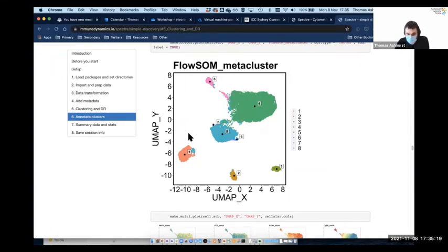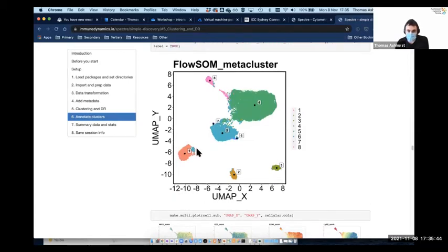Now, there's an important point to make here, which is one that we always need to bring up: these distances are not absolute. Whenever we do dimensionality reduction, we have to make a compromise in terms of how we can get this information on 2D. Typically the easiest way to think about this is that cells that are grouped together in, let's say, an island, we would consider that they're similar to each other. But the fact that the distance from cluster 8 to cluster 1 is a long way doesn't actually mean that they're all that different. It's really only the local relationships.